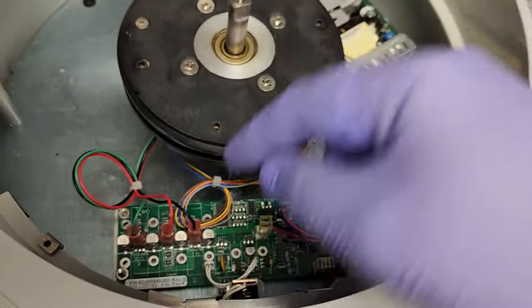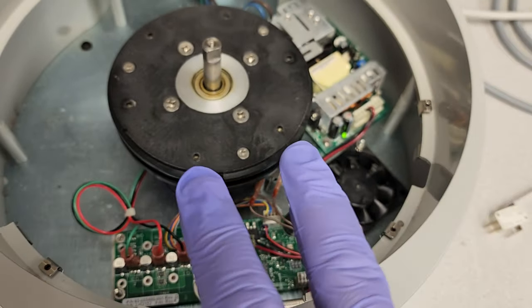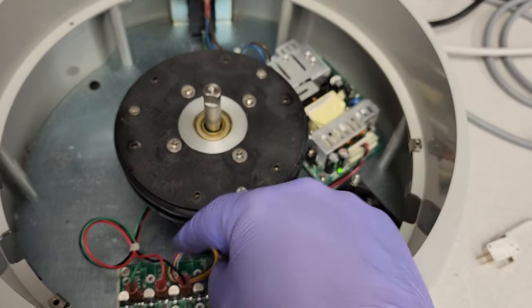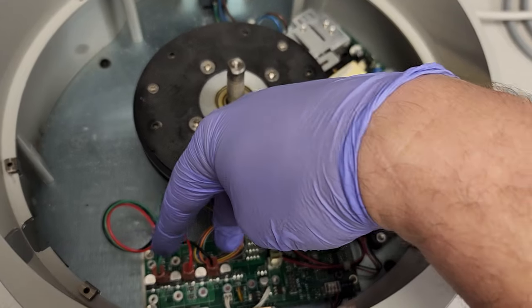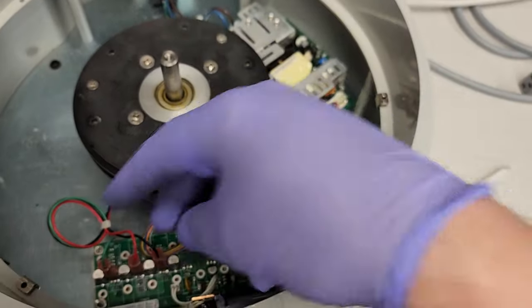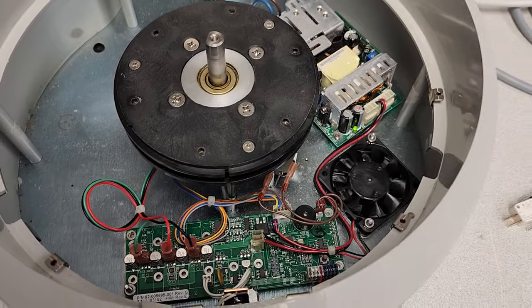When testing three-phase motors, with the power down I disconnect each of the leads and short out two of them together — that's how you test the coils. There's one coil, two coils, three coils — three phases, three different coils inside this motor. With different combinations you can test each one out.